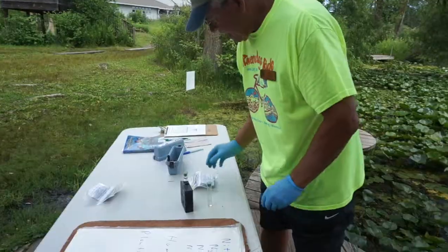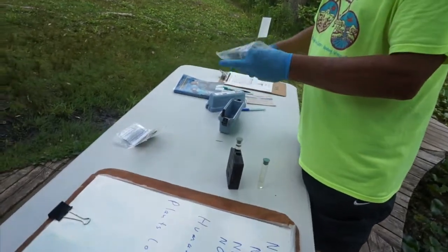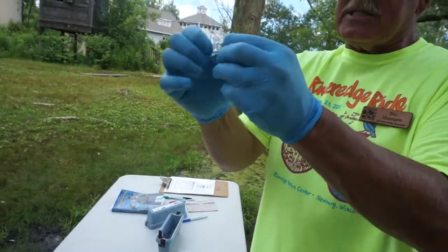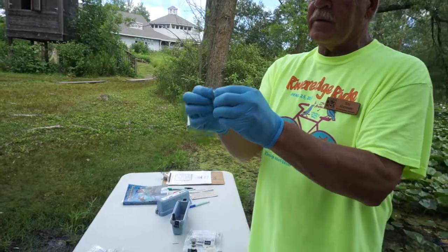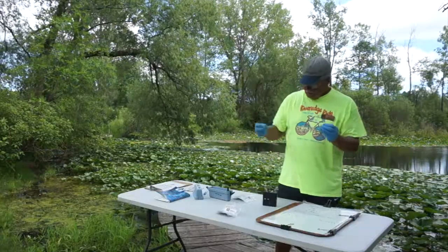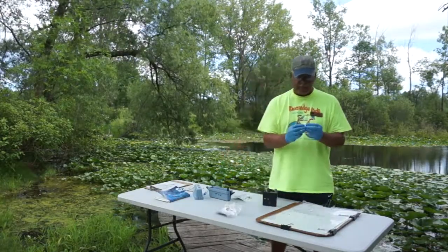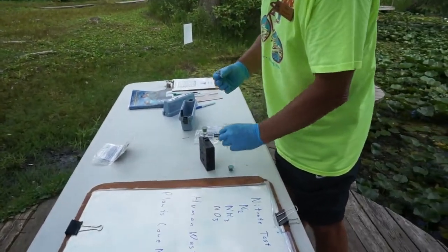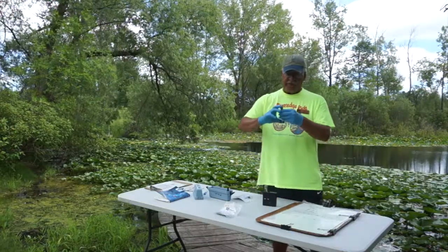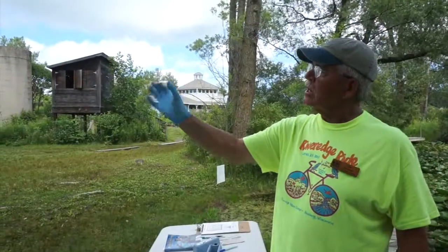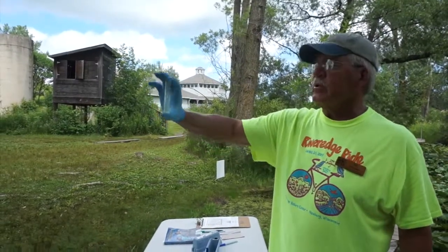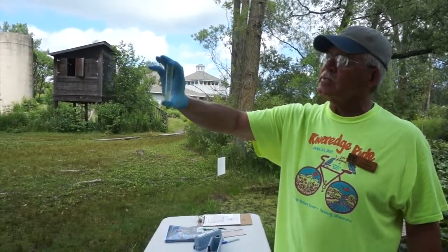Now we've shaken our sample for three minutes. We set it down and go to the Nitrover-3. Again, it's just a little packet like this. Give it one of these shakes so you get the stuff nice and loose inside. There's a little tear line — rip across the tear line. Put the wrapper in your pocket so it doesn't end up as garbage. Take the top off the test tube, dump your chemical in, and shake for 30 seconds.